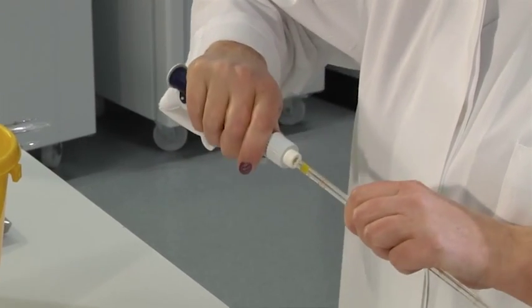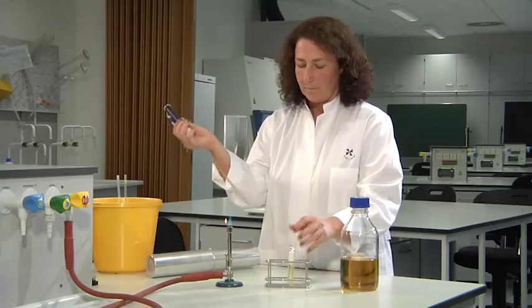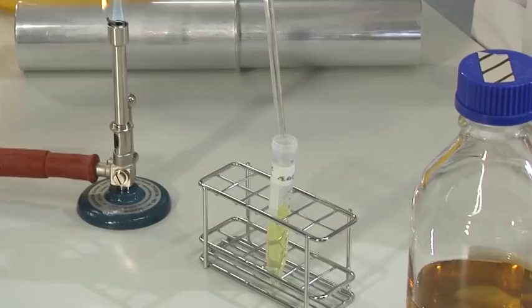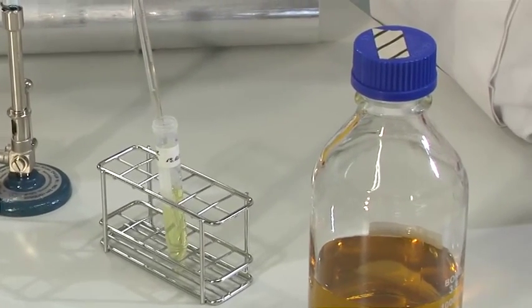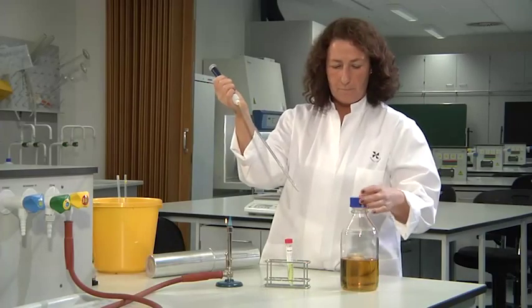Connect a pipetting aid to the pipette and flame. The pipetting aid does not need to be sterile. Measure the desired volume of the sterile solution to be added, then add the solution to the sterile medium.